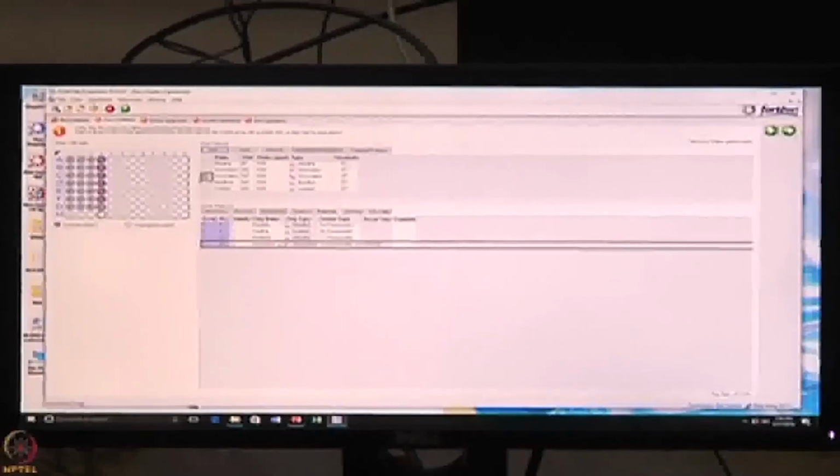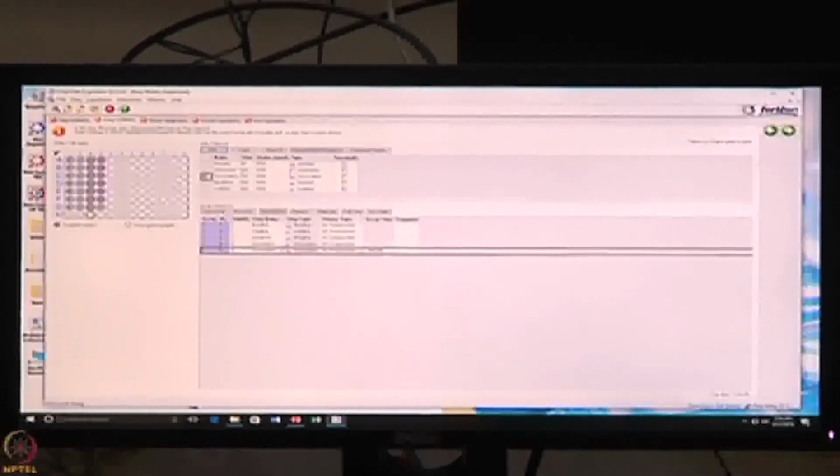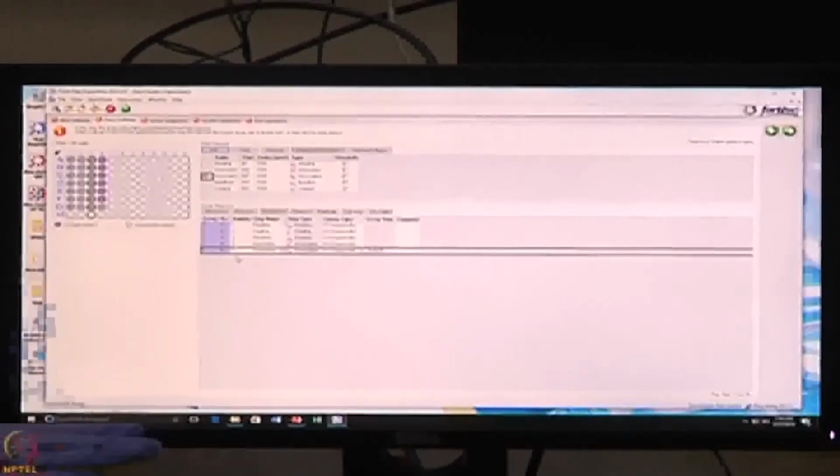And the dissociation, you can ask where exactly it happens. I will do it in column number 3, with the same buffer once again. So 1, 2, 3, 4, 3. The robotic arm moves to the first column, dips into the first well, goes to the second, then the third, the fourth, and back to the third.